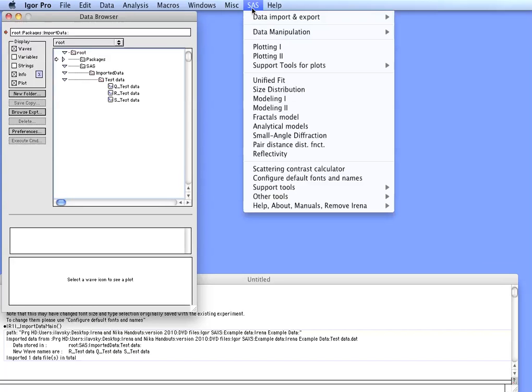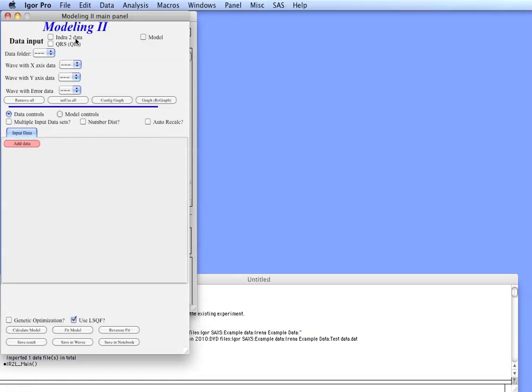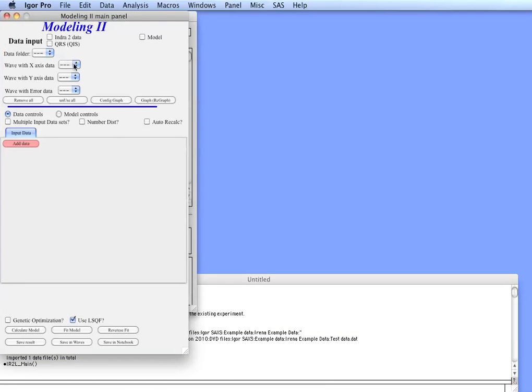Now we can select the Modeling 2 package. This package is a bit more complicated than some of the other ones.